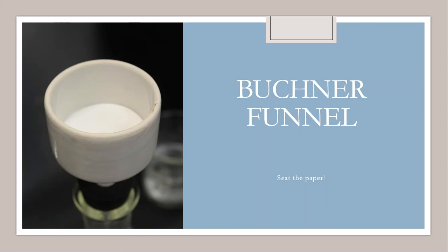All right, so Buchner funnel, like usual, I always want to do what we call seat the filter paper, which means you get it wet. You don't just put a dry piece of filter paper on this Buchner funnel and turn it on and start pouring things through. If you do not seat it, it doesn't completely seal the holes in the Buchner funnel, and your material could escape through those holes and go to the filter flask that's down below.